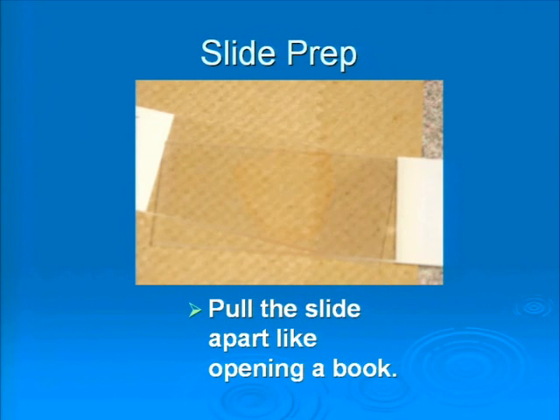And you can sort of see the outline of the sample here. Now it's spread all the way, kind of like this. So now it's spread as far as it's going to spread, and it's called the book method because you can either open it just like this or you can just pop them open, so it gets the name pop-apart or book method.